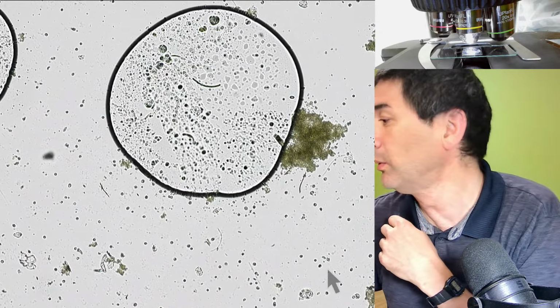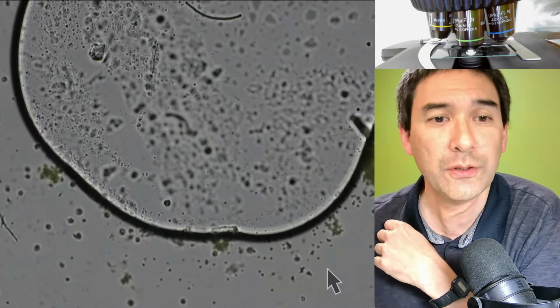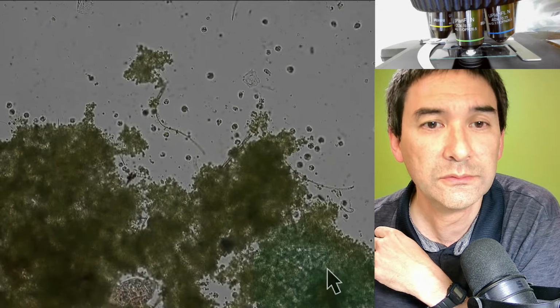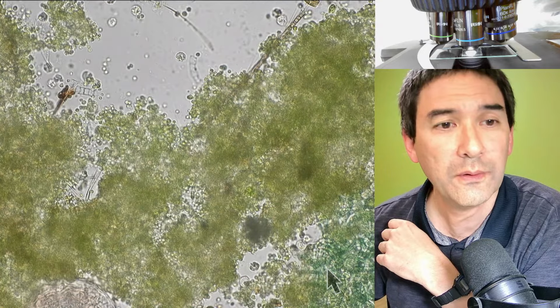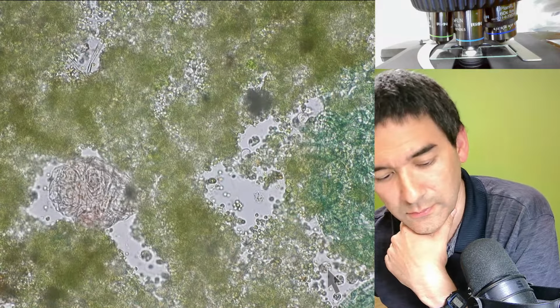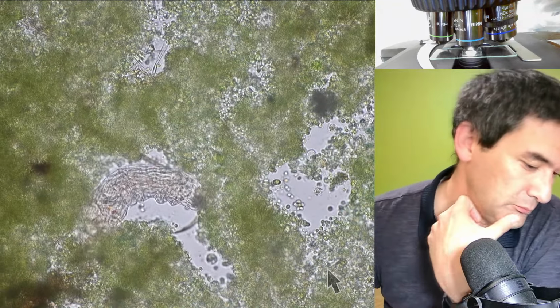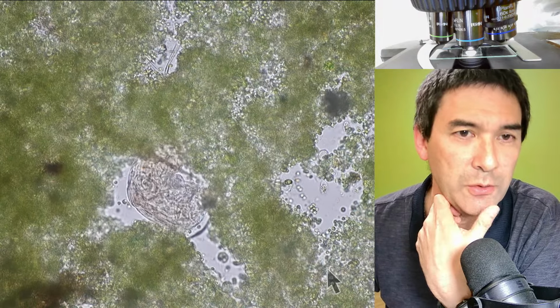Okay. I'll just go up with the magnification. We're just going to find maybe a place where they're still clustered together. And maybe the arrow, I just move up. It's now 40 times. This is not normal. Look at this. There must have been... This must be a contaminant.